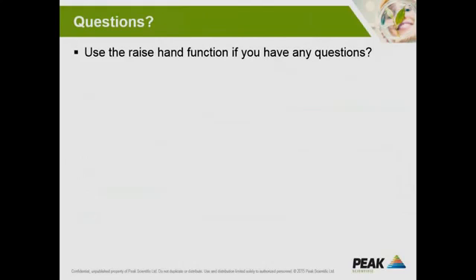So there are possibilities for larger labs. But the systems are designed to be used within the lab. And we'd recommend that they're kept within the lab so that the conditions that the generators are stored in are also within the recommended temperature range, between 20 and 35 degrees, and also so that the humidity levels are not moving around too much. So we normally recommend that the systems are kept between 50 and 70% relative humidity.